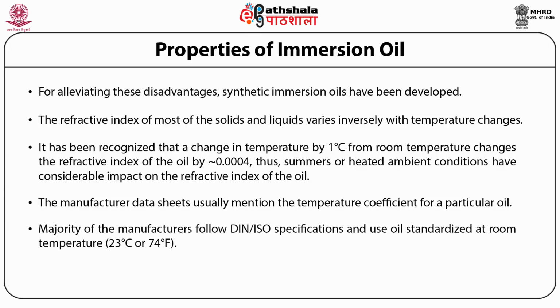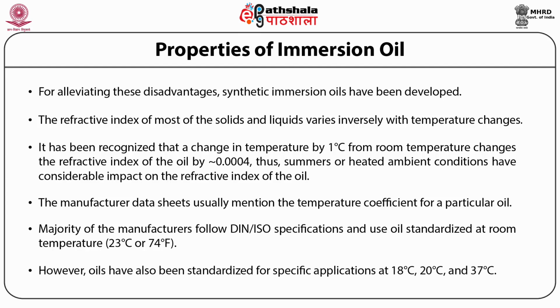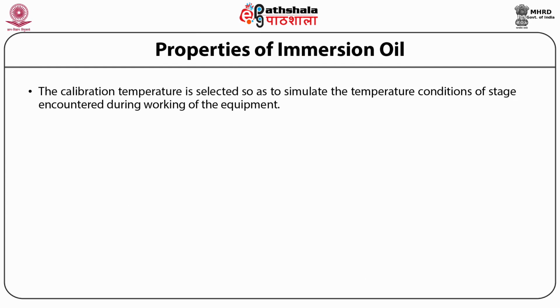The majority of manufacturers follow DIN or ISO specifications and use the oil which is standardized at room temperature, that is 23 degrees centigrade or 74 degrees Fahrenheit. However, oils have also been standardized for specific applications at 18, 20 and 37 degrees Celsius. The calibration temperature is selected so as to simulate the temperature conditions encountered during working of the equipment.